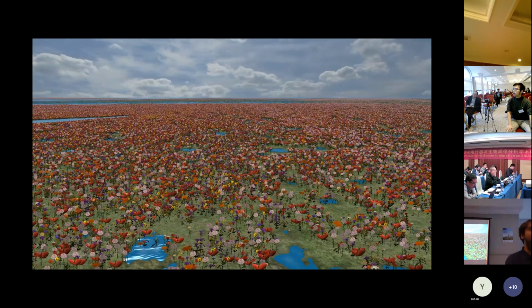Exactly, but we put all this effort in so that we do that work once. The challenge is that when you load the visualization, it loads as fast as possible, for example in 5 seconds. In 5 seconds you have access to this data set and can view everything seamlessly, easy to use to analyze the data.